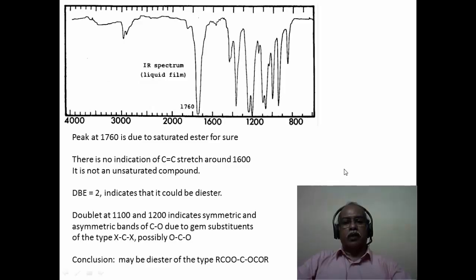The infrared spectrum is very rich in information here. There are no OH functional groups present in the system, so it cannot be a carboxylic acid, it cannot be a phenol, and it cannot be an alcohol kind of functional group here. There is a small broadness that you see here, which is essentially probably due to the moisture of the sample or because of the presence of moisture in the air.